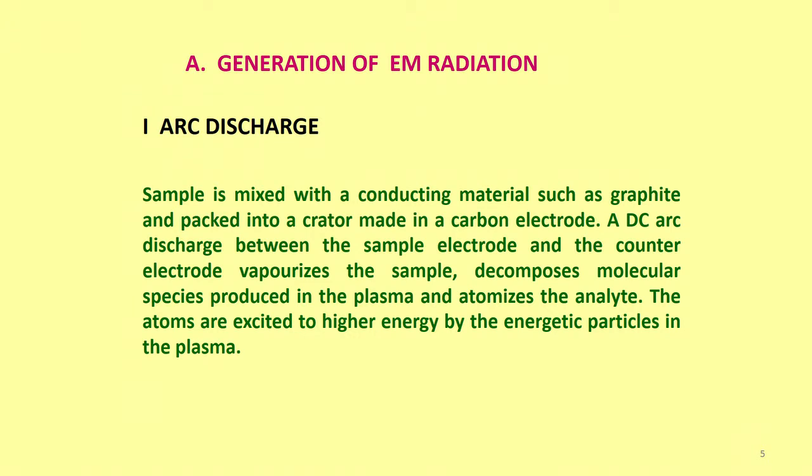There are different ways of doing it, and the first one I am going to discuss is the arc discharge.